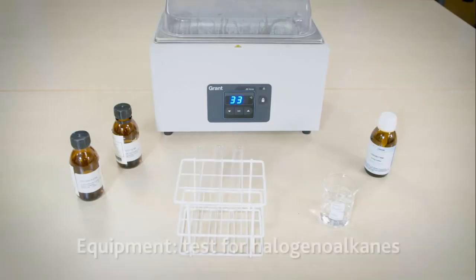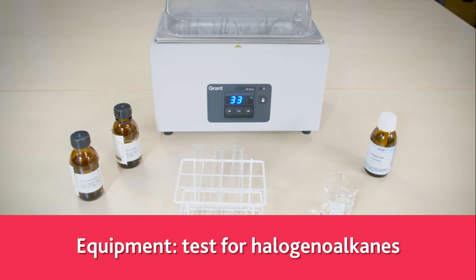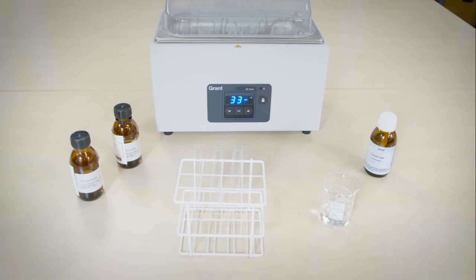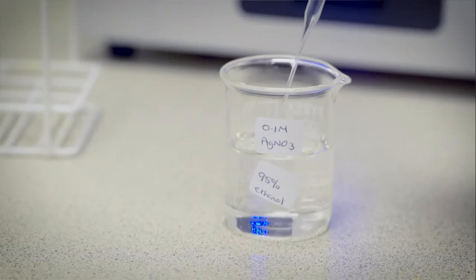To test for halogenoalkanes, the first step is to perform a substitution reaction, which releases the halide ion. The halide ion is then tested with silver nitrate to confirm the presence of either chloride, bromide or iodide.